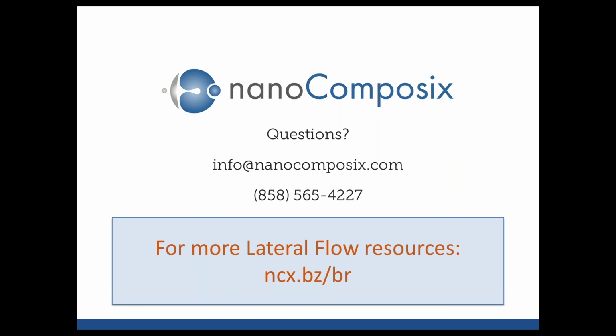This question comes from Liz. For screening purposes, do you usually start with passive by default and then move to covalent assay later?